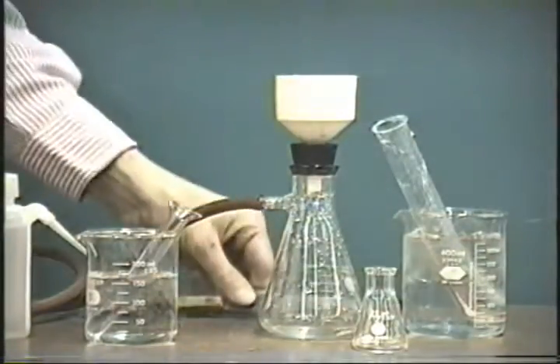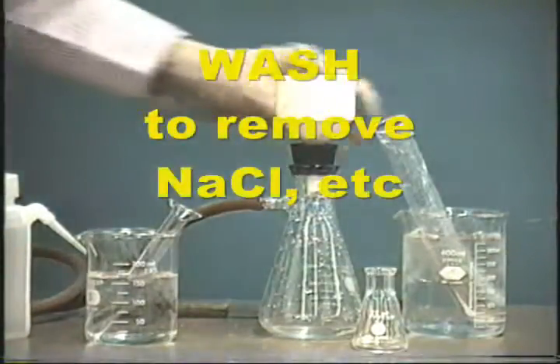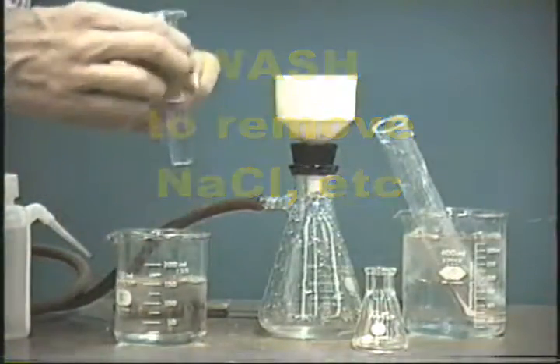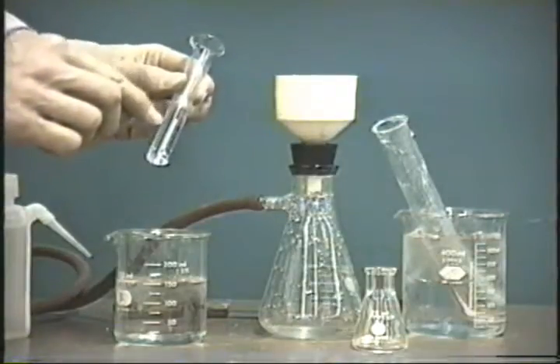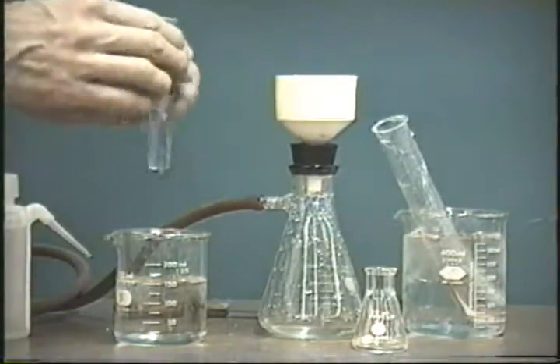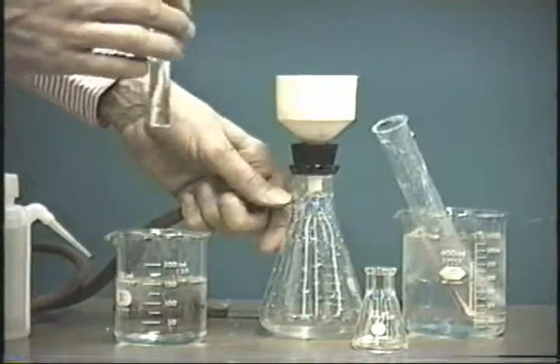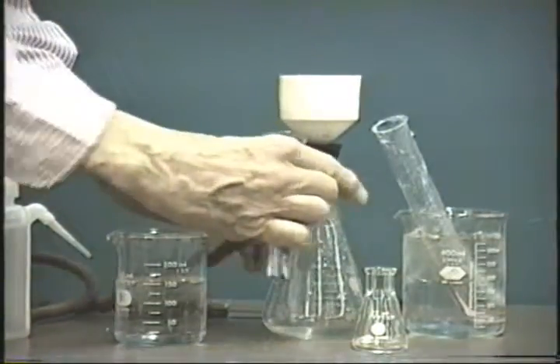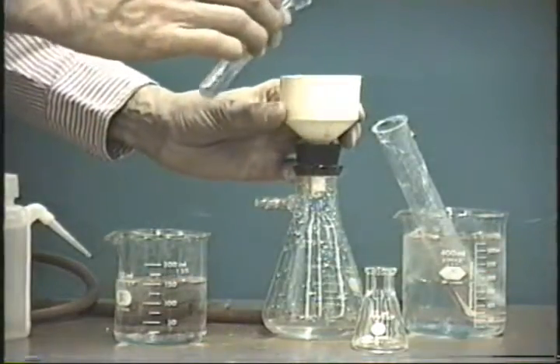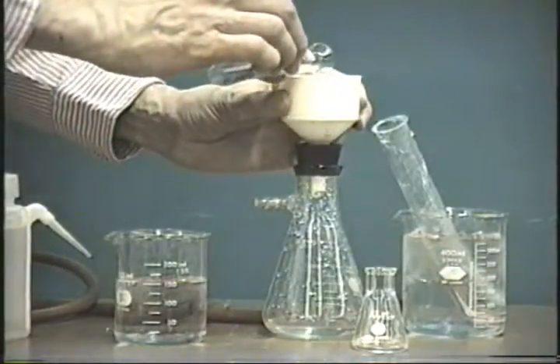And now we can start the washing procedure. We will wash it with water, using only a little bit, about 6 milliliters, and we'll wash it twice. When you wash it, disconnect the suction, put in about half of this water, and spread it out over the sodium bicarbonate.